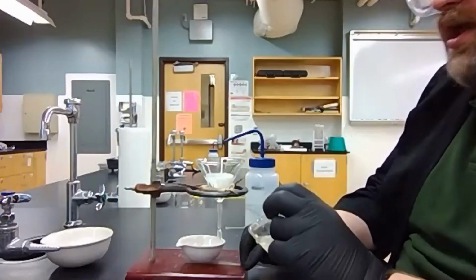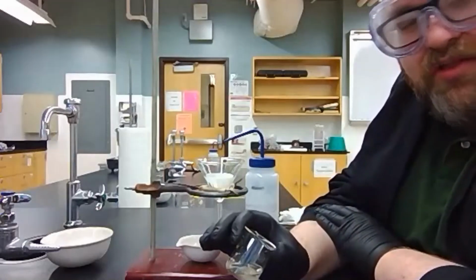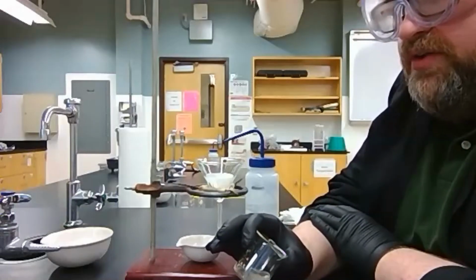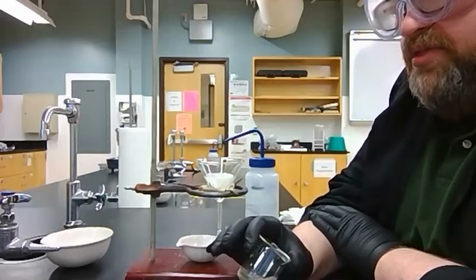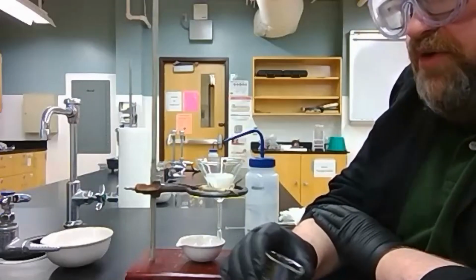Now, one other way of knowing that this is done is that sand has a vaguely beige color and salt is a white crystal. So if I look in here and I see any white crystals rather than beige miscellaneous shapes, I probably need to add a little bit more water. But right now, this looks really good. So I've prepared my funnel and I'm ready to go.